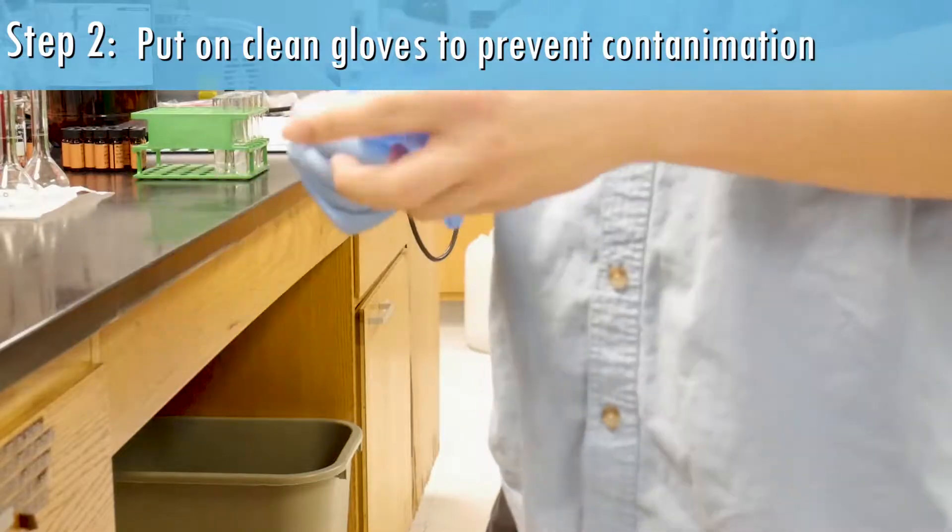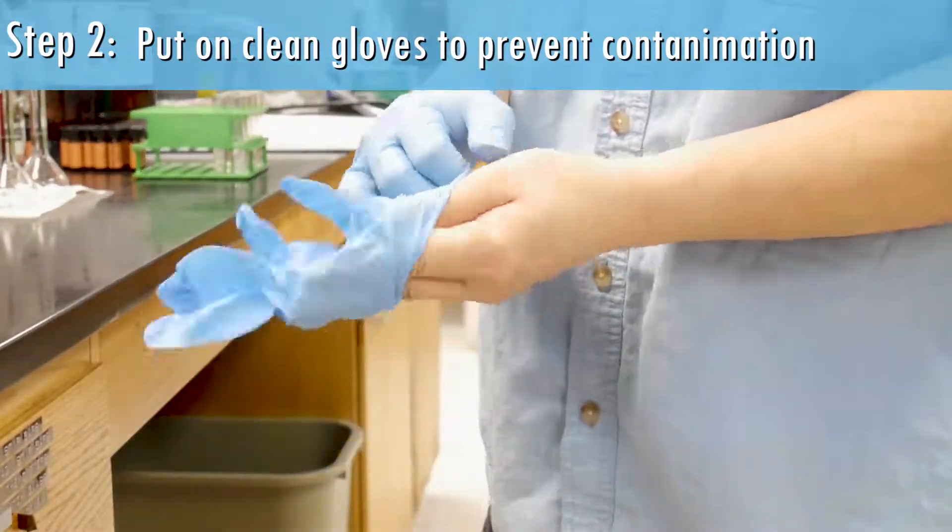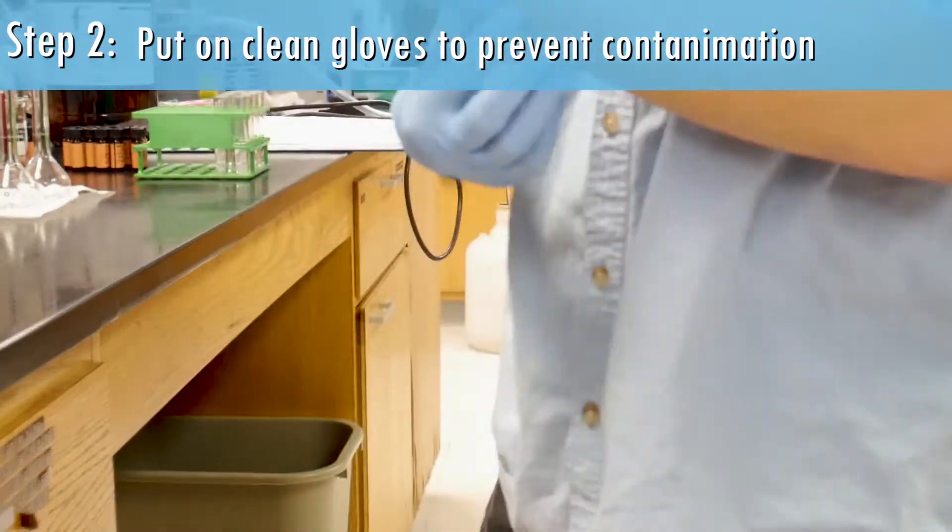Step 2: Put on clean gloves so that contamination of the clean micropipette tips does not occur.